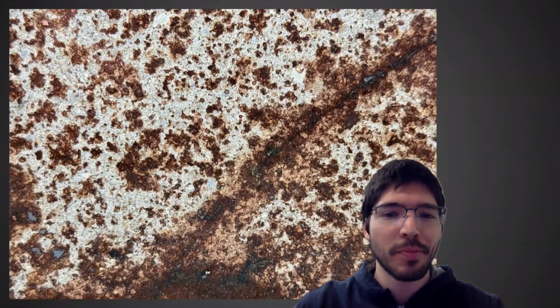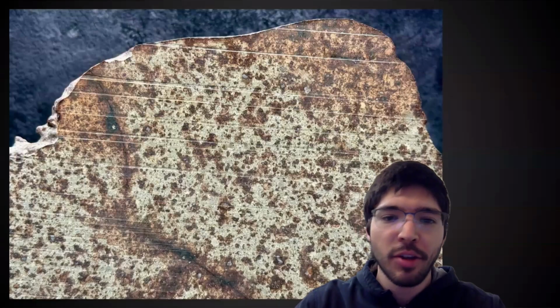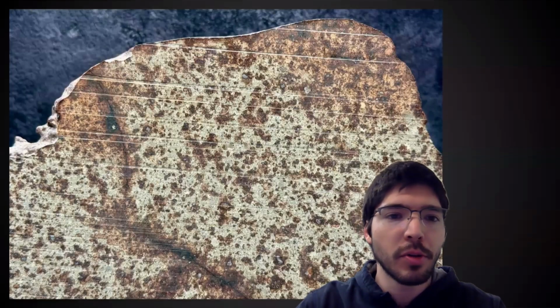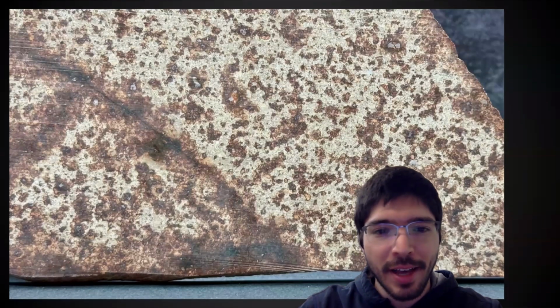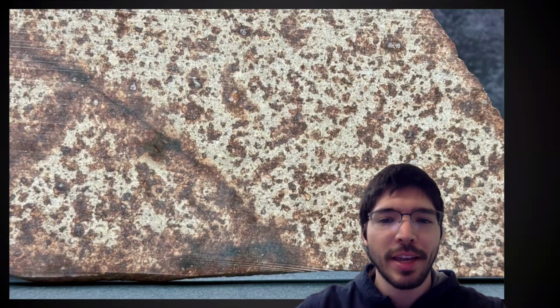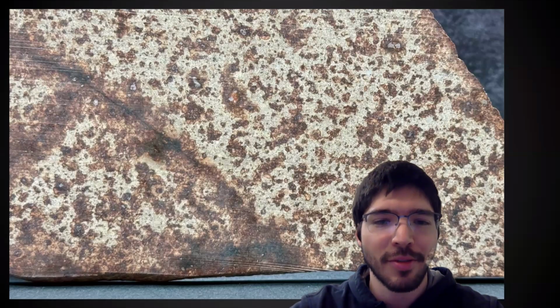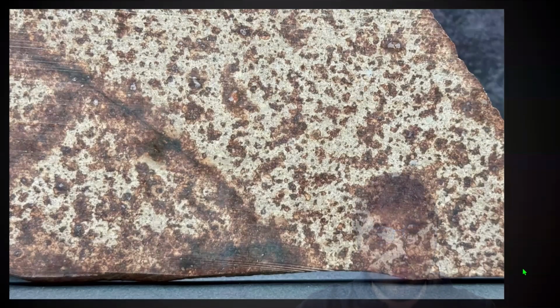There are some specific kinds where you definitely want to get chondrule diameters, but it's good practice to include a few of them in there, or at least if we see a few chondrules, just say that we found a few chondrules in the sample. As you can see, it's really hard to pinpoint many chondrules in this sample, and it's very equilibrated, is the term that we tend to use for this. All right. Those are them.